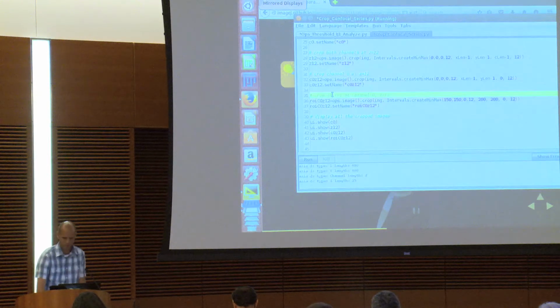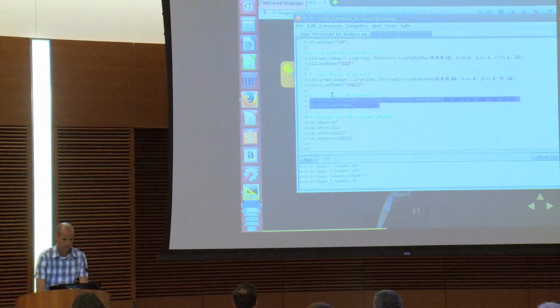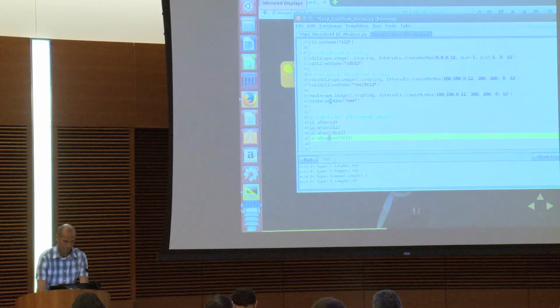So the first thing I would do here is I would copy a previous code snippet that crops. Just assign a simple variable here. New is probably not a good idea. New im, it's a little better. And also add a line of code to show it.